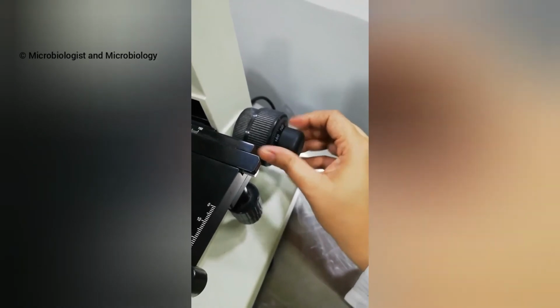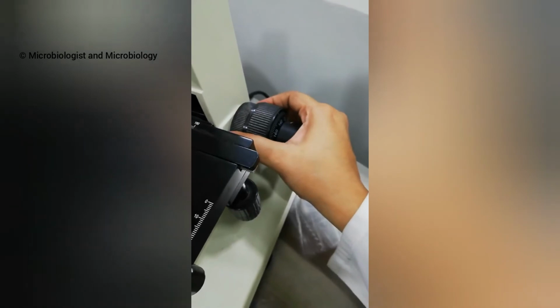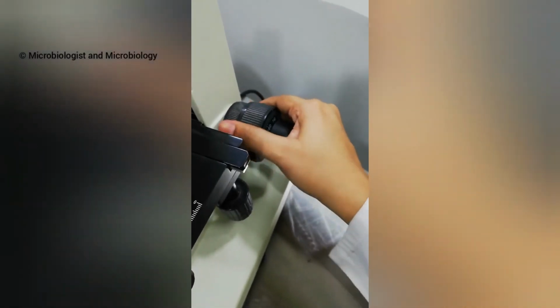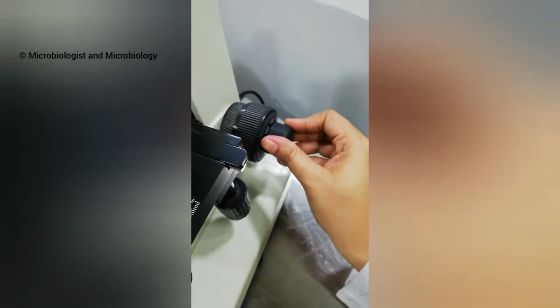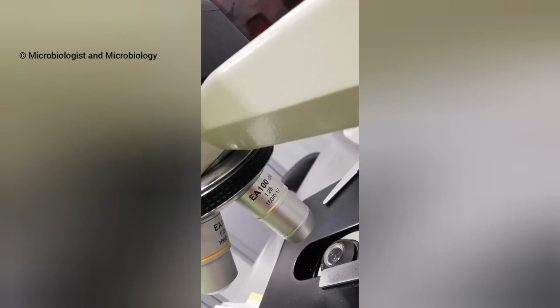When you finish using the microscope, make sure that you clean it. To clean it, you will use lens paper. Don't use tissue paper or cloth. Use lens paper to wipe off the oculars, and you can also wipe off the objectives. If you used oil on your microscope, you want to use the lens cleaner to clean off any oil. Just put a couple of drops on your paper and wipe to remove any oil.